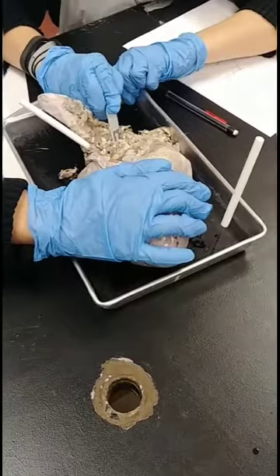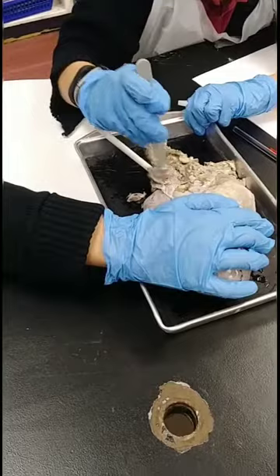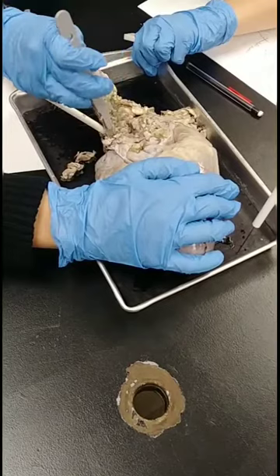Here we go. The veins are much thinner than the arteries. This whole thing is a pulmonary trunk. Make sense? Then we'll go locate the pulmonary vein.